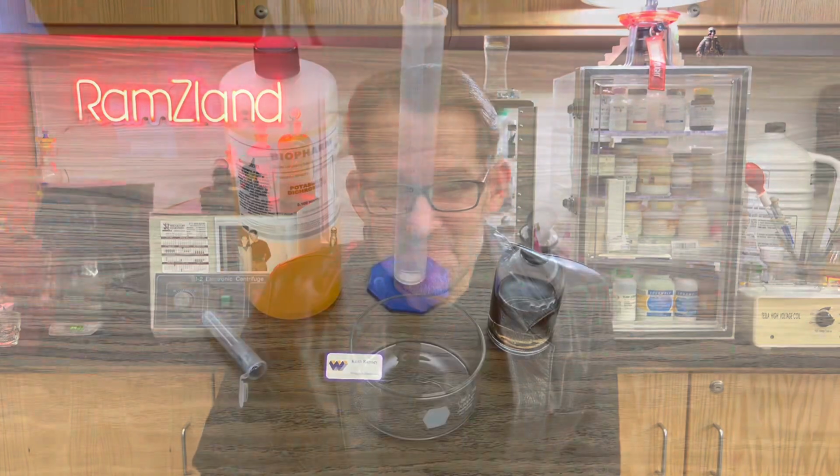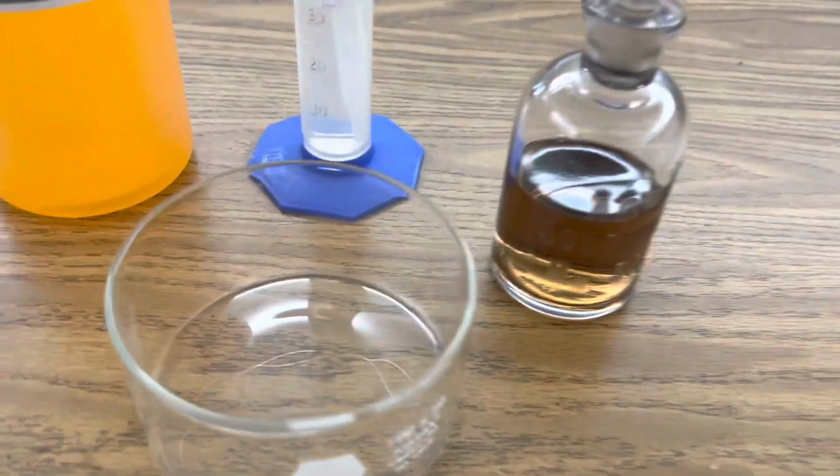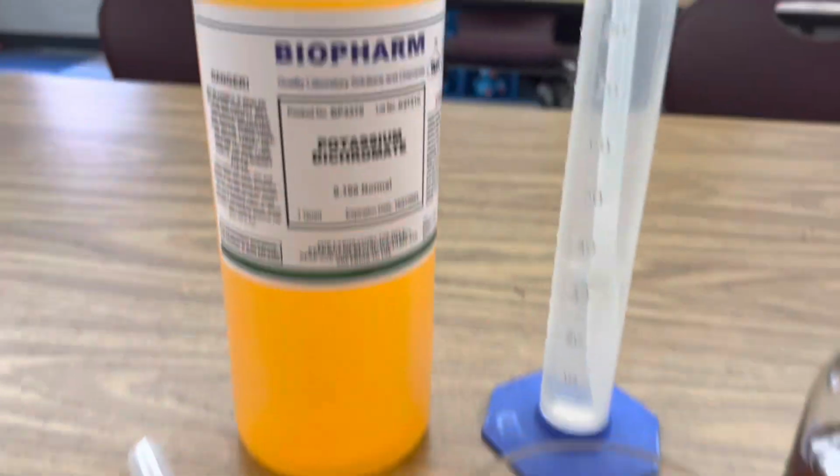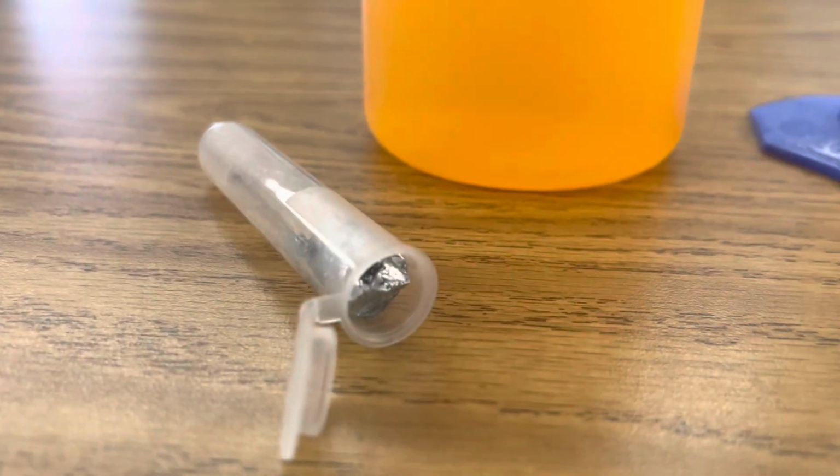Today I want to show you the beating heart of gallium. Check this out. All I'm using in this investigation is 18 molar sulfuric acid, my dish, some potassium dichromate, my dropper, and of course, gallium.